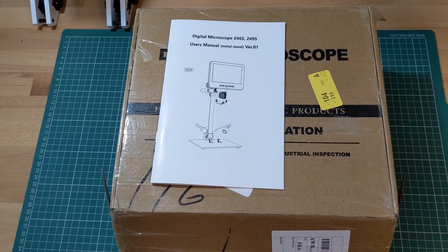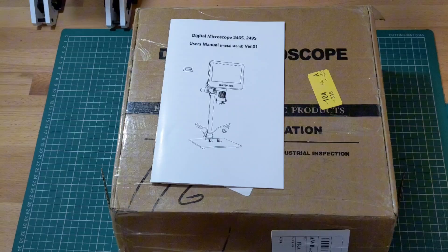Hello and welcome to Dan Makes Things. My name's Dan and today I have something a little different for you. The folks over at Microlink have very kindly sent me their LM249MS digital microscope to help with my project. In this video I'll be unboxing the microscope, setting it up, and giving you my first impressions.